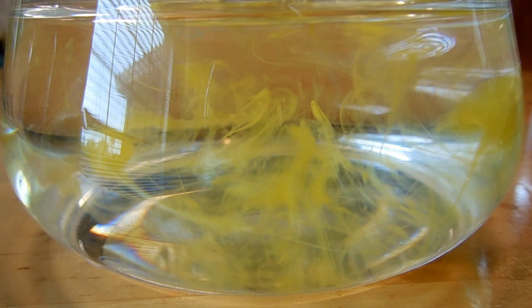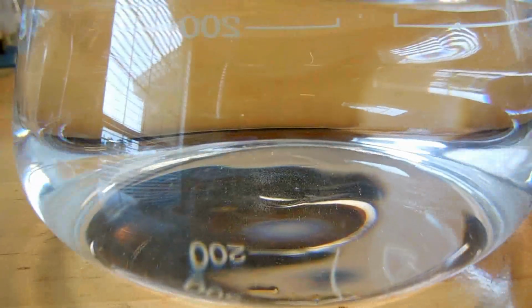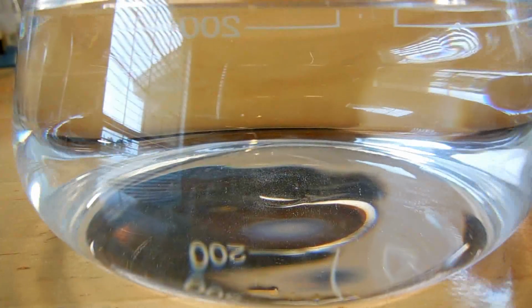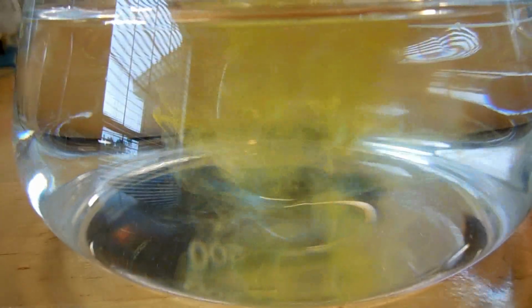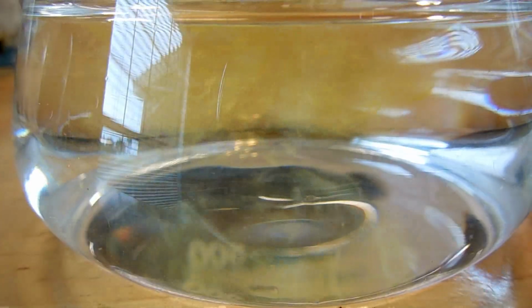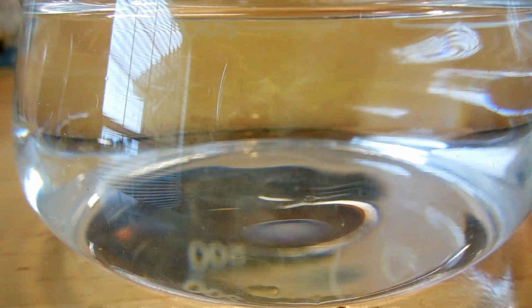And I think after a minute it dissolves again. Let's try to swirl it a bit. Yeah, so it is slightly soluble, which is interesting. So let's keep going. So you can see that once I add it, it's a real bright yellow, and then as the solution swirls around a bit, we get some dissolution, and that goes away.